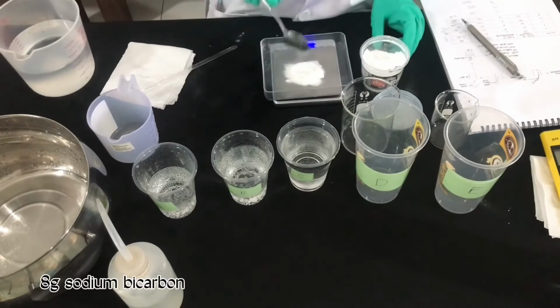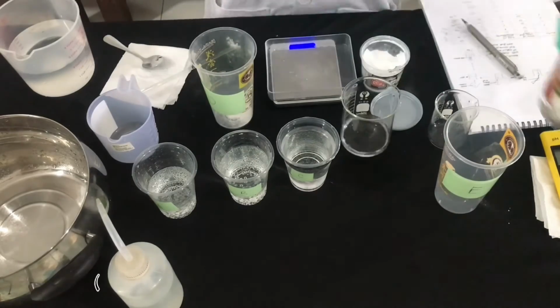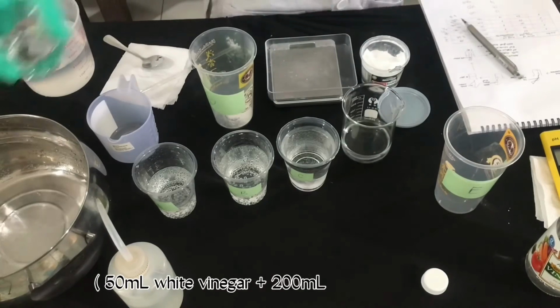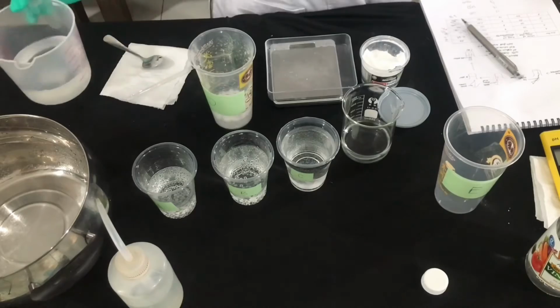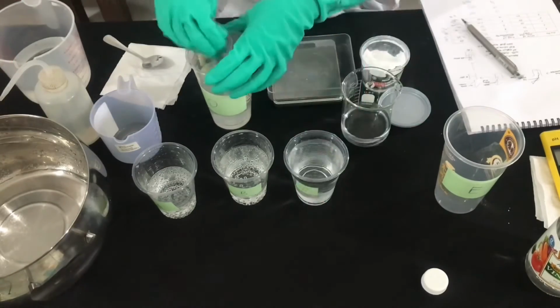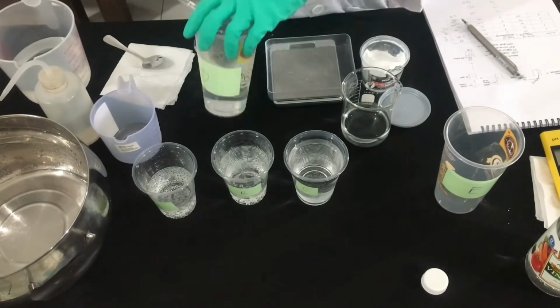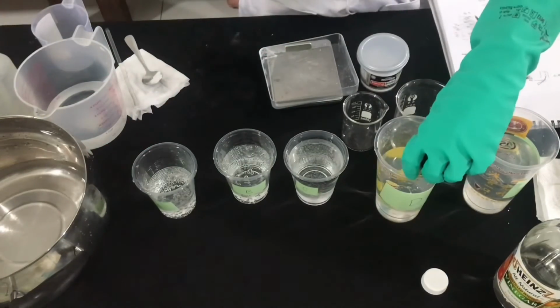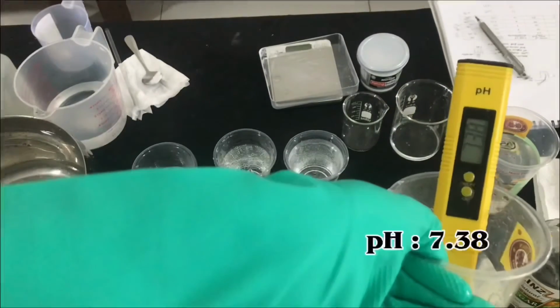For cup D, 8 grams of sodium bicarbonate was weighed and transferred into the plastic cup. Next, 50 ml of 0.83 molar white vinegar and 200 ml of water was added. The solution was stirred until all the sodium bicarbonate was dissolved. I measured the pH value for cup D and I get 7.38, which is still in the range of pH 7.